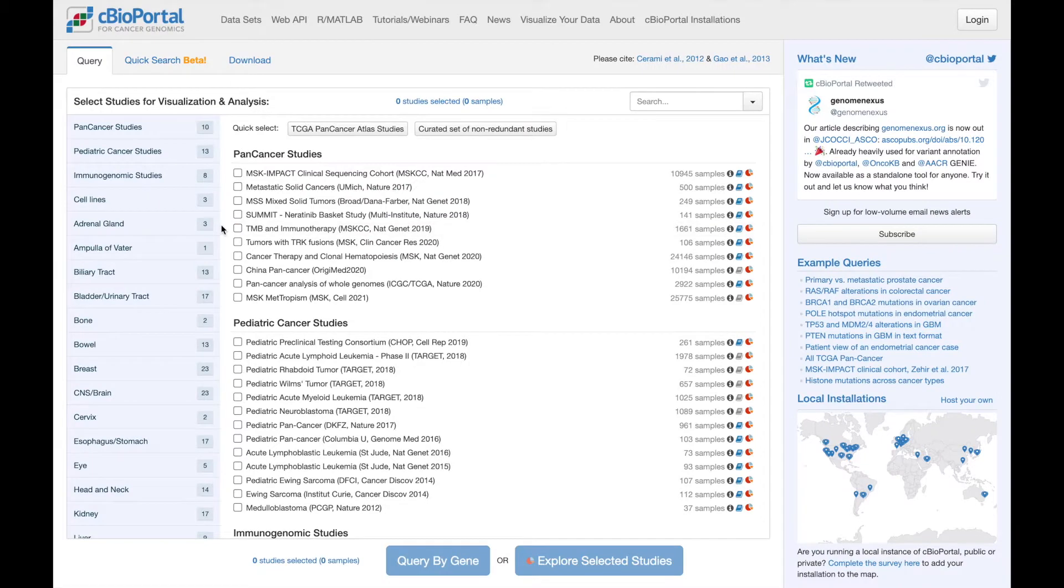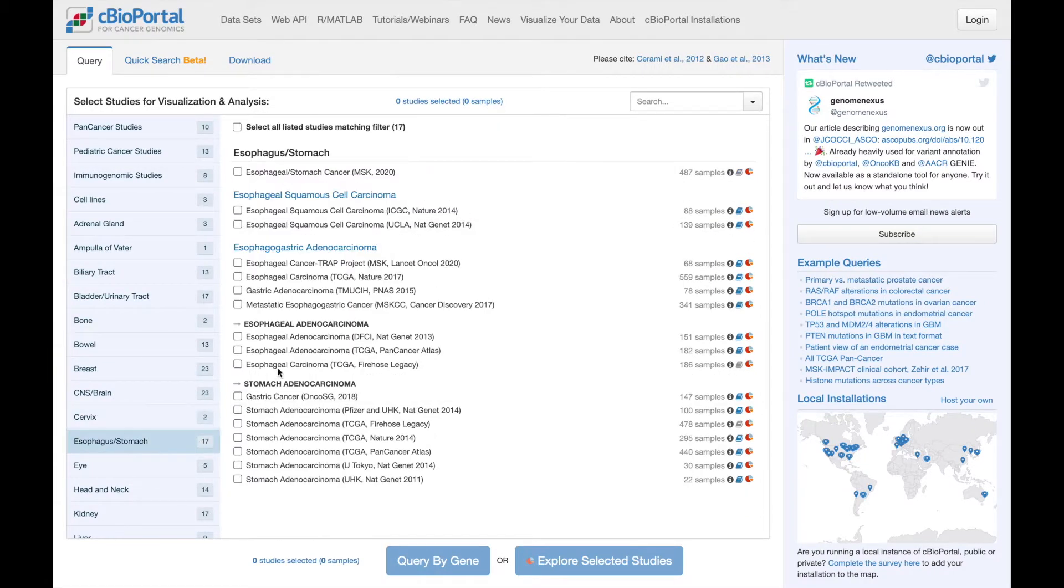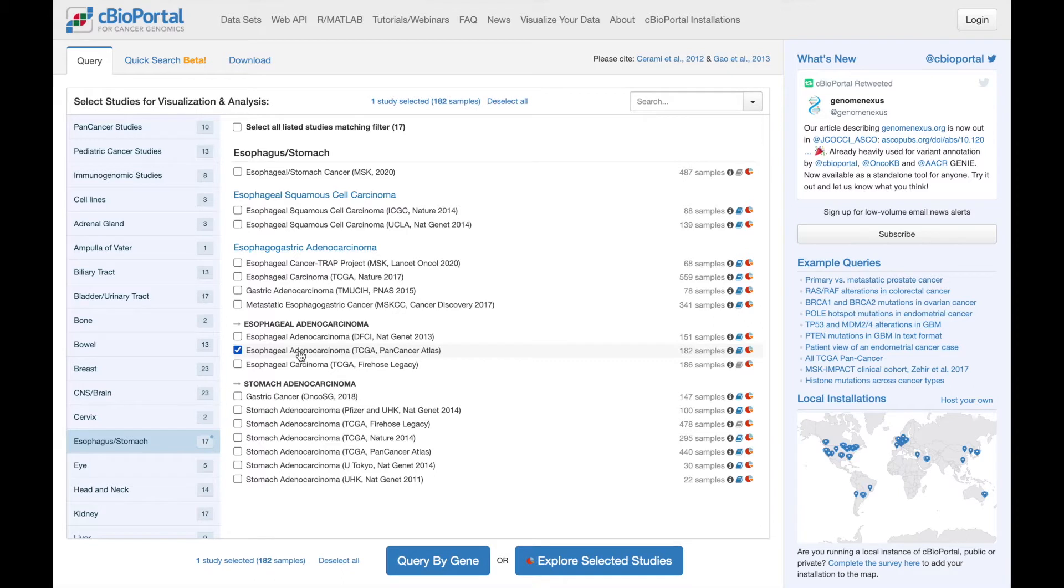We'll start by selecting a study, and for this example, I'm going to choose this TCGA pancancer atlas study of esophageal adenocarcinoma.